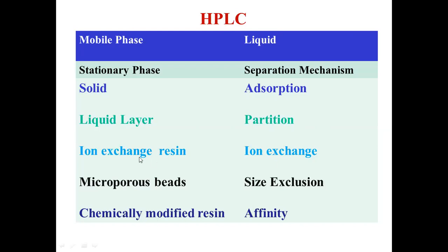And an ion exchange resin is nothing but a resin containing either positively or negatively charged polymeric groups, and along with that positively or negatively charged polymeric group, there will be a negatively or positively charged free ion present in the resin. These free ions are movable, they are not stationary, but the charge which is fixed to the polymeric bead will be fixed, that cannot be interchanged. But the free ions, which are carrying the charge, are likely to be replaced by ions of like charge.